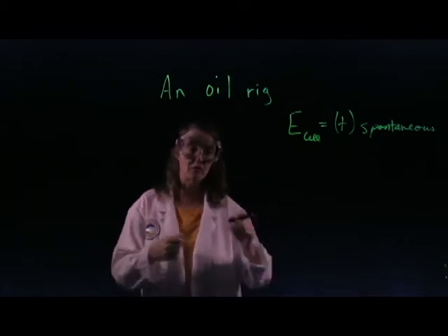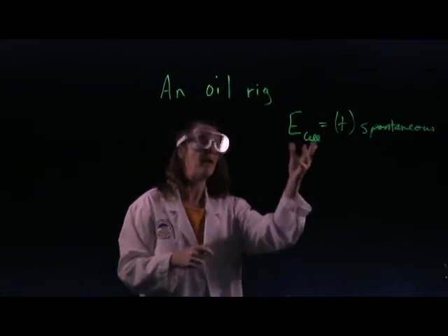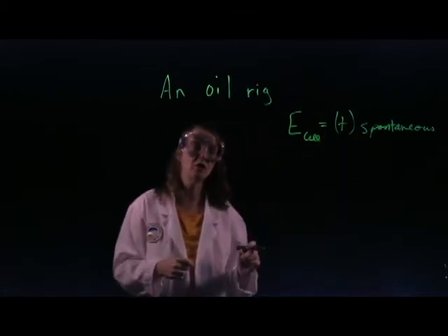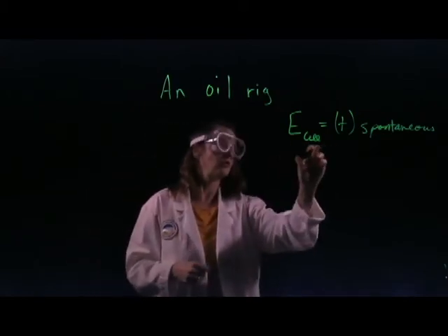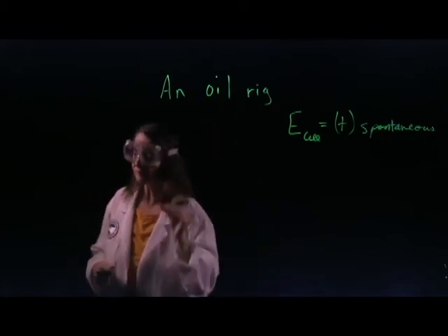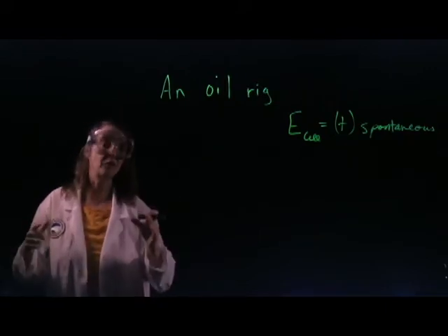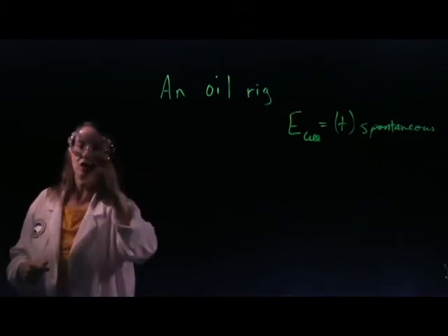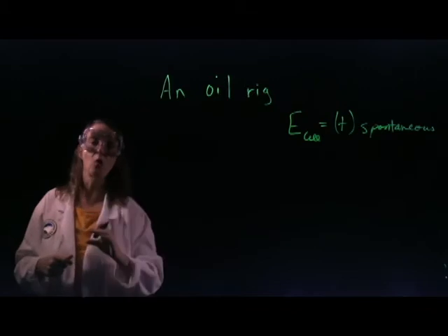And we've got a bunch of different metals that you're going to be putting together and then attaching voltage probes to them and measuring the voltage. We're going to compare the measured voltage to the theoretical voltage. In other words, we're going to look at these E cell values that you measure and compare them to the theoretical ones. The theoretical values can be determined from the reduction potential table. In that table, all of the reactions are half reactions showing reduction only.